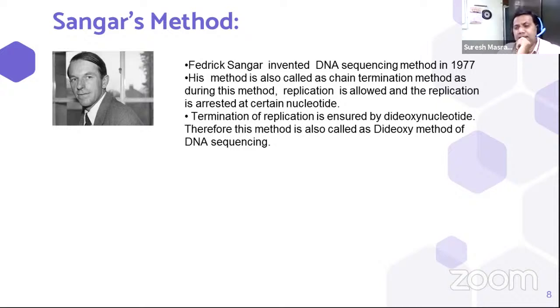Now, as the hydroxyl group over the third carbon atom is lacking there, once such a dideoxynucleotide attaches with the preceding nucleotide, it does not allow another nucleotide to get attached with it, because the extending hand which it may have in the form of a hydroxyl group is absent.